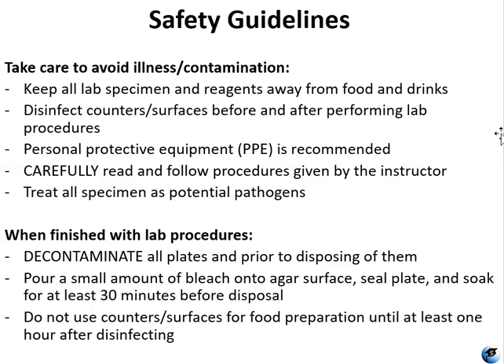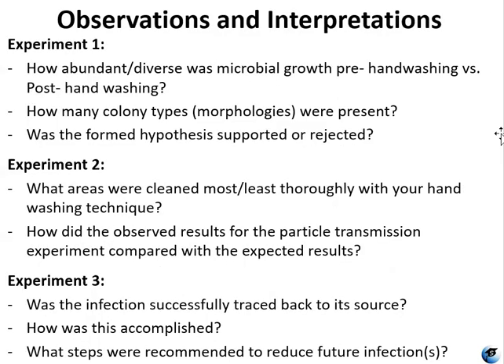For your observations and interpretations, for the first experiment, you want to make note of the abundance and/or diversity of the microbial growth before and after hand washing. How many different colony types are present? Was your hypothesis supported or rejected?